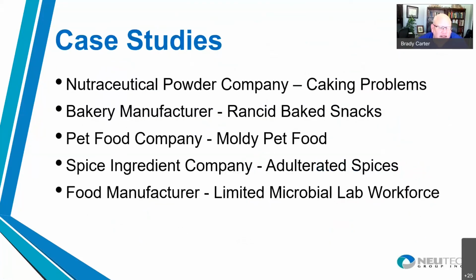So the case studies that we're going to cover today include looking at caking problems with a nutraceutical company, rancidity problems with a bakery manufacturer, moldy pet food problems for a pet food company, adulterated spices for a spice ingredient company, and then limited microbial lab workforce for a food manufacturer.